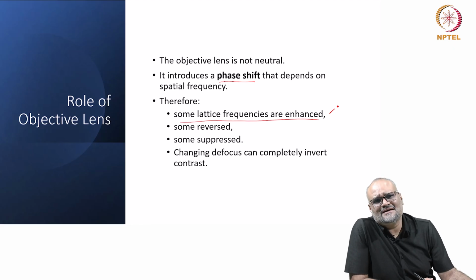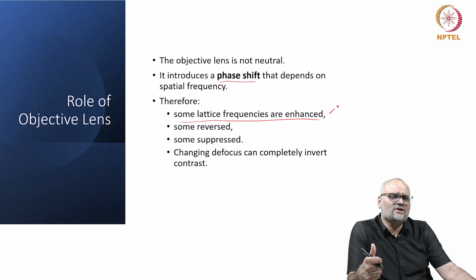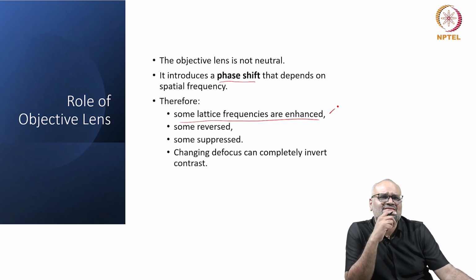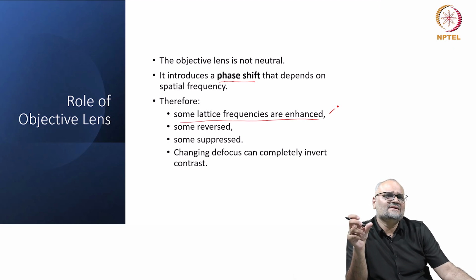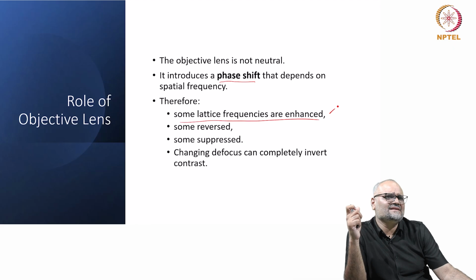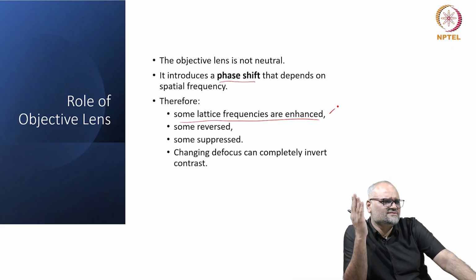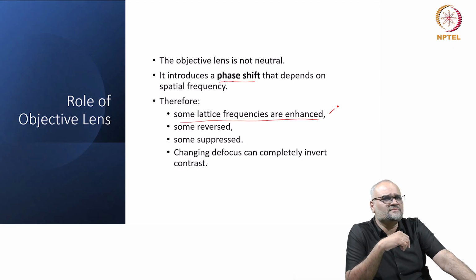In fact, I get the first diffraction spot as 200 when I am orienting the specimen along the 001 zone axis, and the 200 spot and the central beam together, if it is in a two beam sort of condition, interfere together to form the micrograph. And physically, how do I understand this? You have to start imagining how this 200 plane actually looks like within a face-centered cubic lattice.